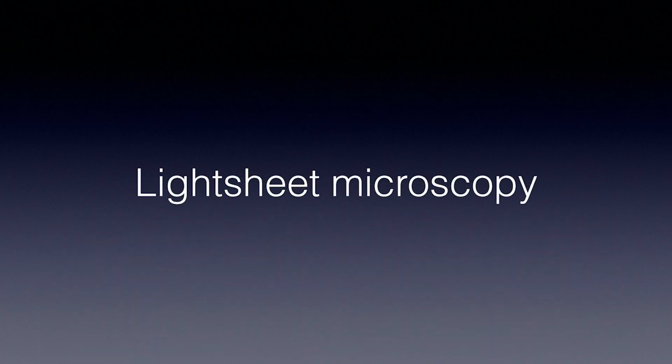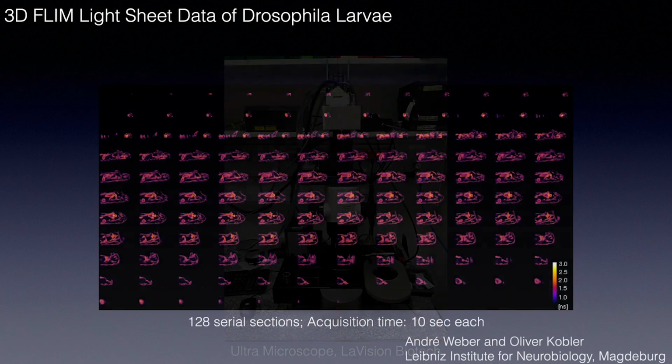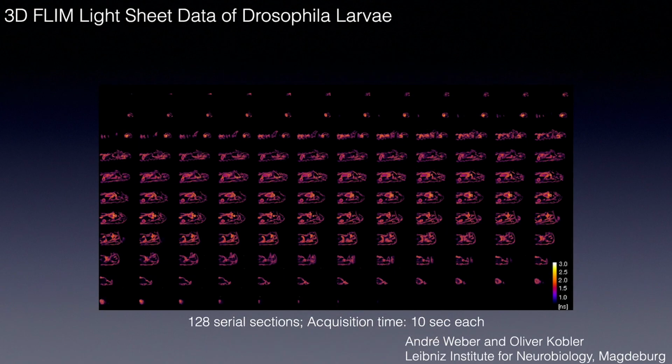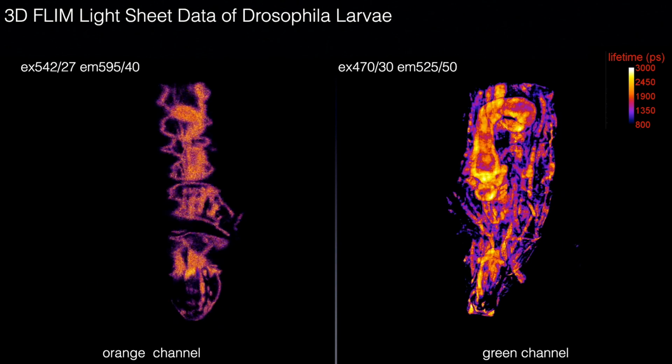Having a photon counting camera pushed us to test with more wide-field microscopy techniques. TIRF was already mentioned. Here we present a light sheet method. In the photo, you can see a commercial light sheet microscope. Luckily, it's equipped with a supercontinuum laser that gives full flexibility of wavelength selection. And it's pulsed. We performed a measurement of double transfected Drosophila larvae, producing a total of 128 sections. In these movies, you can see a 3D reconstruction of FLIM image stacks.